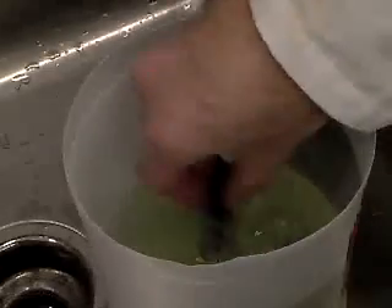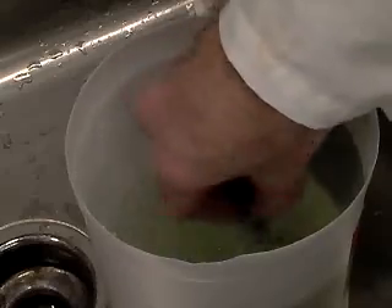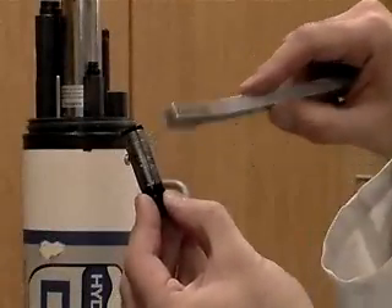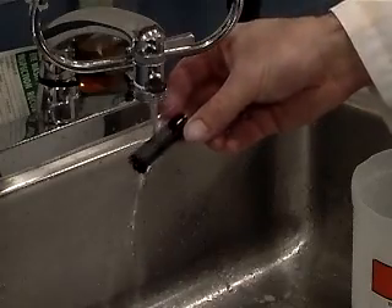Clean the membrane by vigorously, but carefully, stirring the water with it. If more cleaning is required, a brush with very soft bristles can be used to gently dislodge stubborn debris. Rinse the membrane in a dilute bleach solution for 5 minutes to kill any biological growth. Then rinse in clean tap water.